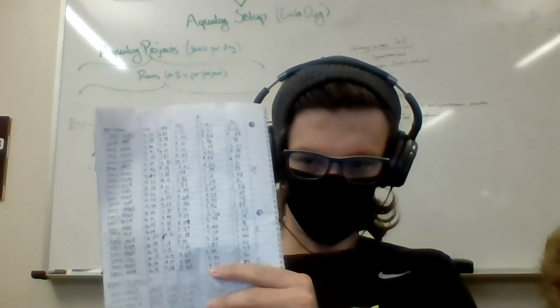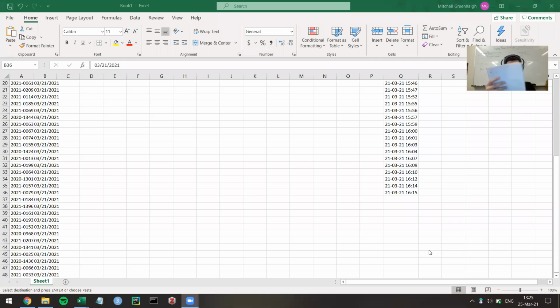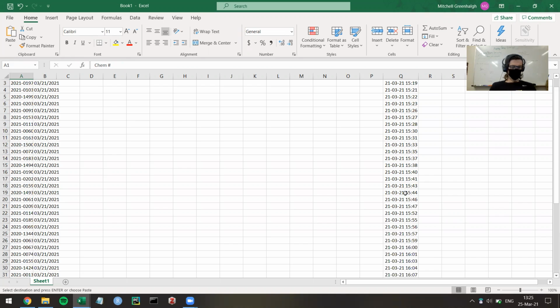So I'm going to go back, and so looking at the physical record, 1615 was the last one run of that day, and 0079 was the last sample run that day, for this event at least. And then the beginning of that run was 0108 and 1518.